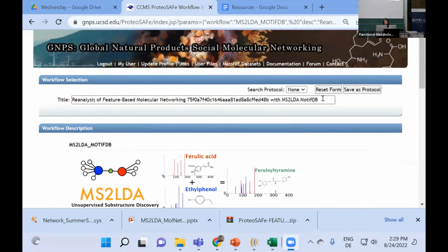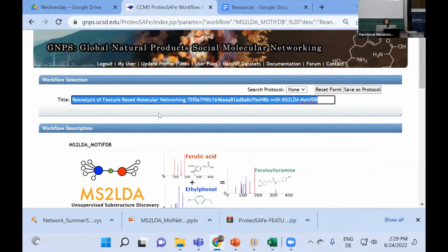So the first thing you can do is give your analysis a title here. It's really just a title of your choice. So we can say DOME Interlab study and then MS2LDA.